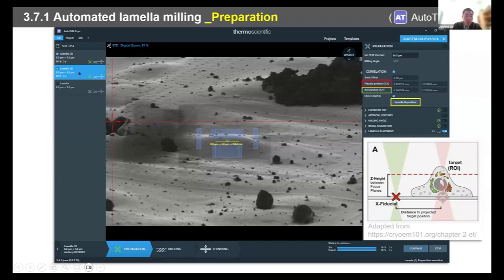So for example, you pick up one and just drag the fiducial marker, which is highlighted in red here. So you drag this one to the fiducial marker, and the region of interest which you added in the map software will automatically be dragged to the location along with the fiducial marker, which should be the location of the signal which you have.